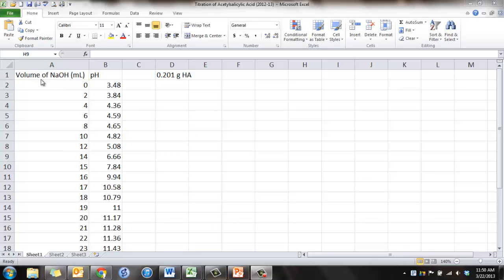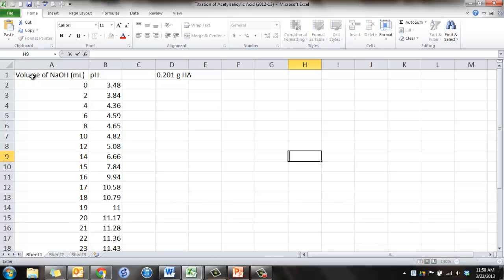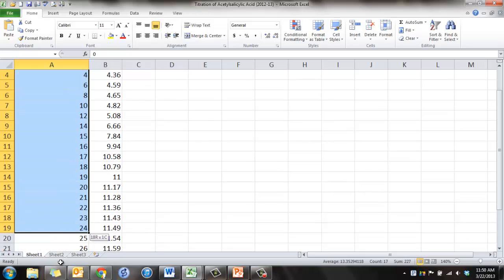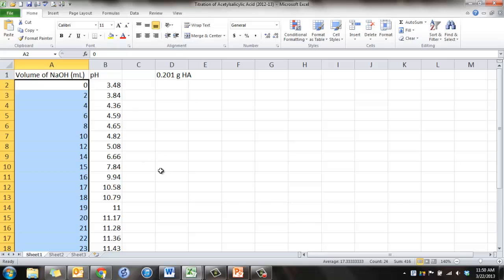So in A1, put the volume of sodium hydroxide in milliliters. In column B there, B1, pH. And please copy those volumes and pHs in like so.